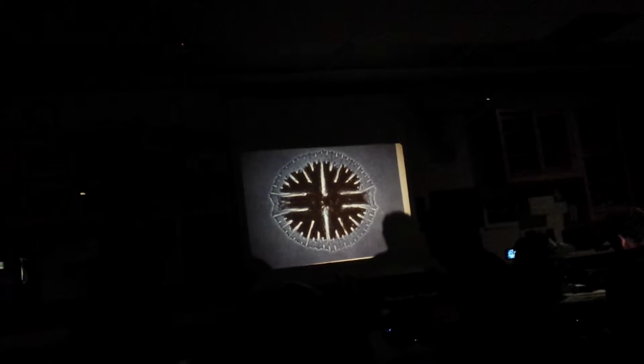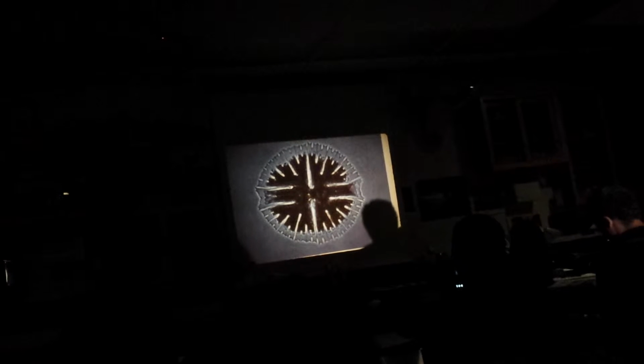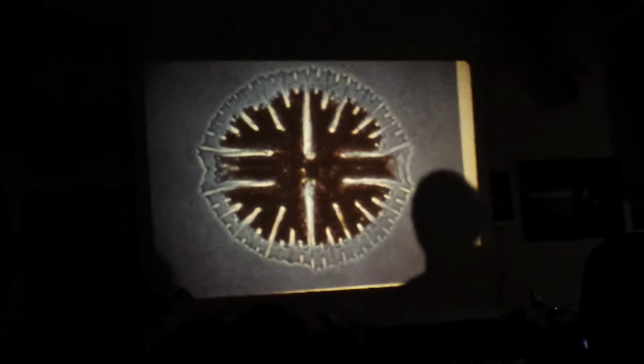Yeah, chlorophyta. Or chlorophytes, either way. What's that? A diatom? Look, yeah, it's good. Desmid, yeah. It looks kind of like a diatom, but see how it's got the semicell? Right here is the separation. This is the semicell on this side, this is the semicell on this side. So you've got chloroplast, nucleus, isthmus across the middle there.